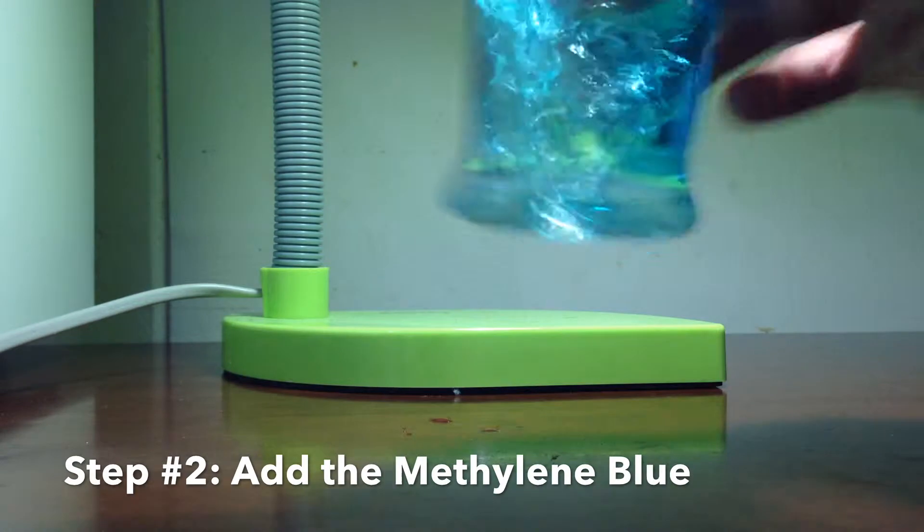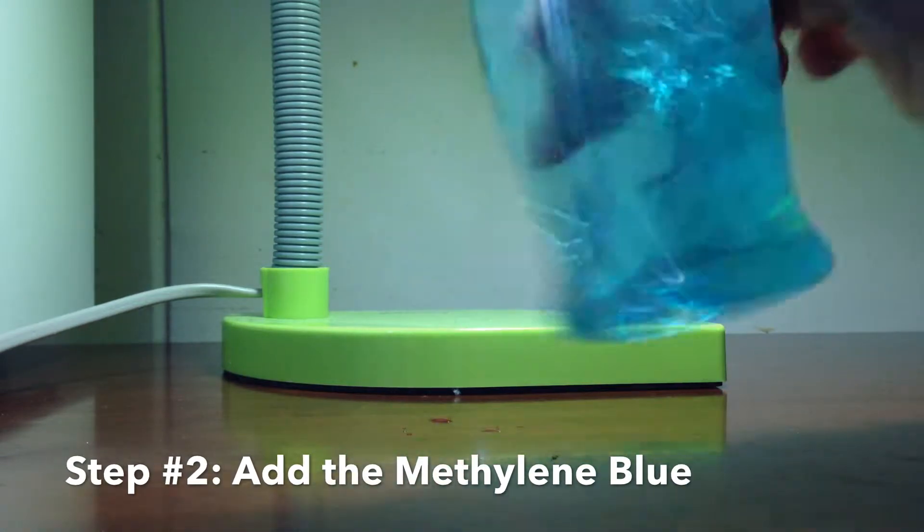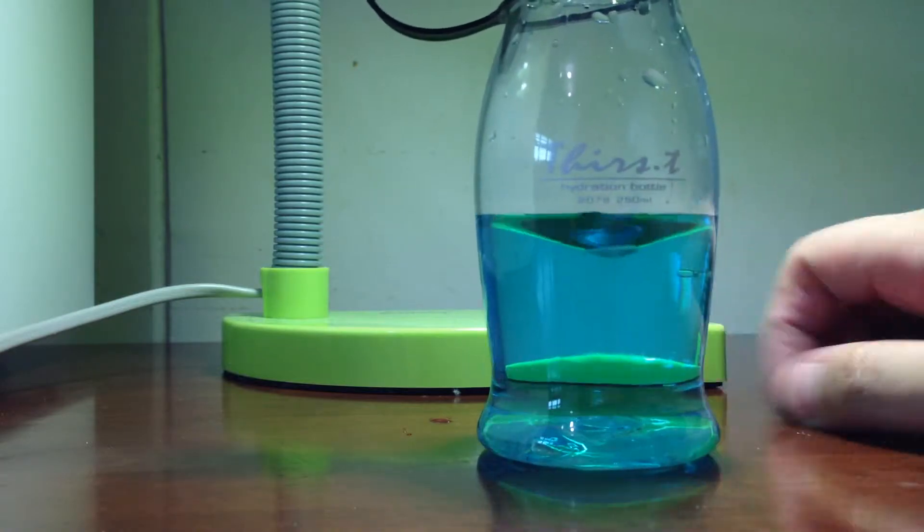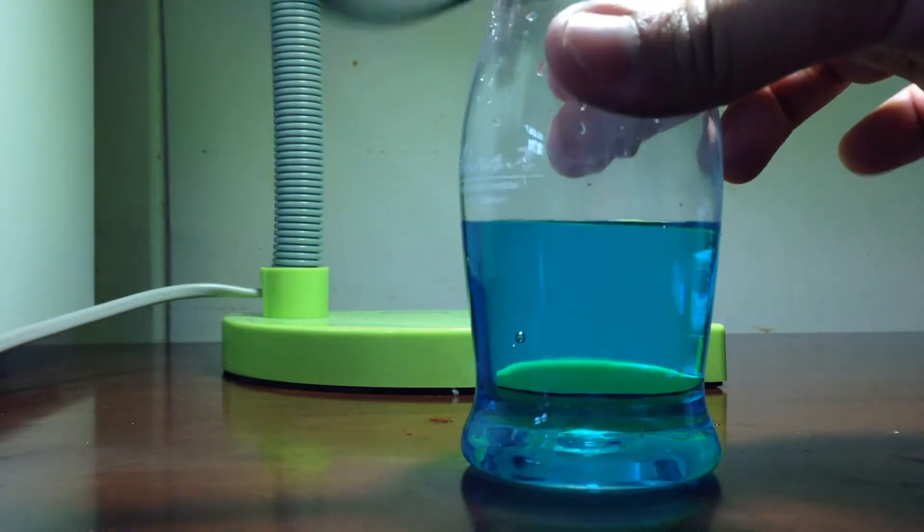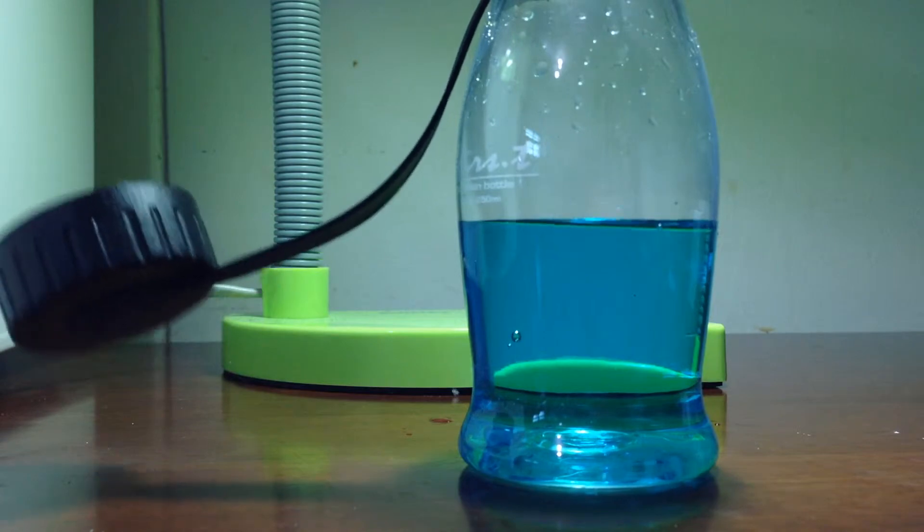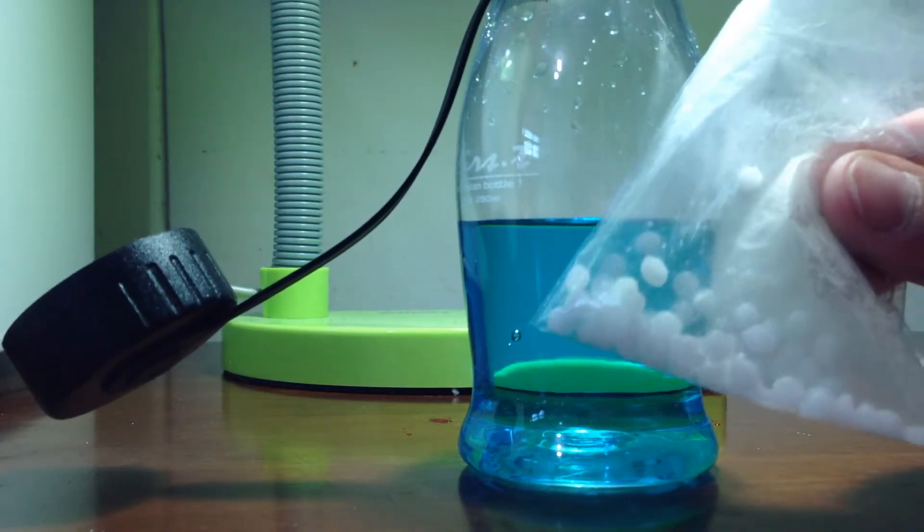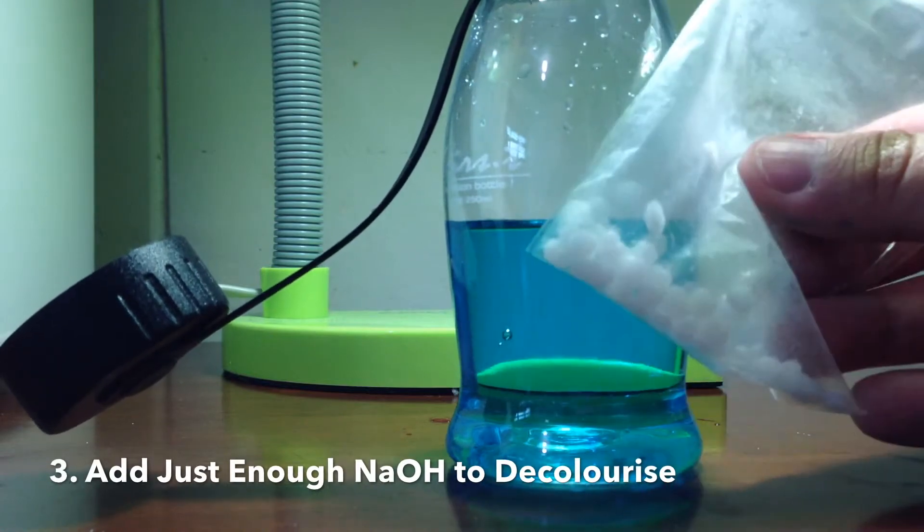Give the bottle a good swirl again. Add sodium hydroxide pellets, pellet by pellet, until the blue color disappears.